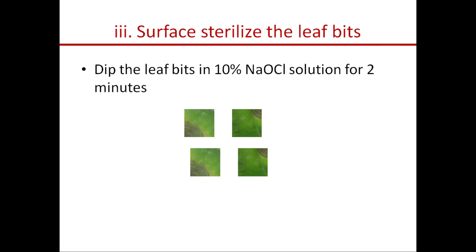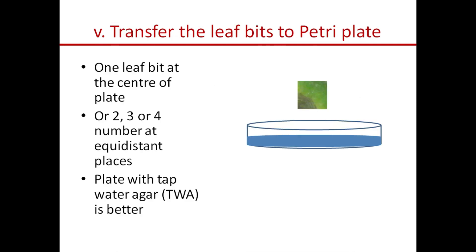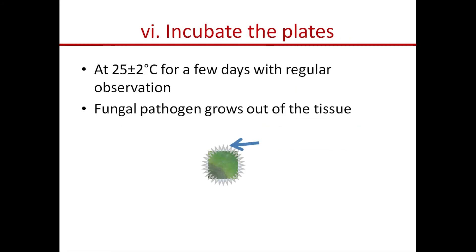Surface sterilize the leaf bits by dipping them in sodium hypochlorite solution for two minutes. Then wash the leaf bits with sterile water using two to three changes of sterile water. Dry the bits with sterile blotting paper. Then transfer the leaf bits aseptically to a Petri plate — you can transfer one leaf bit at the center of a plate or two, three, or four leaf bits at equidistant places — to a plate containing nutrient medium or tap water agar.